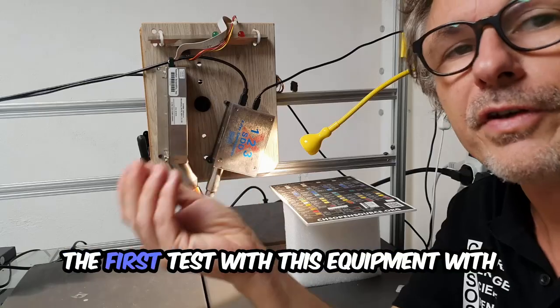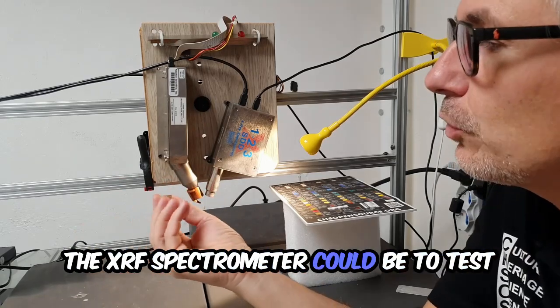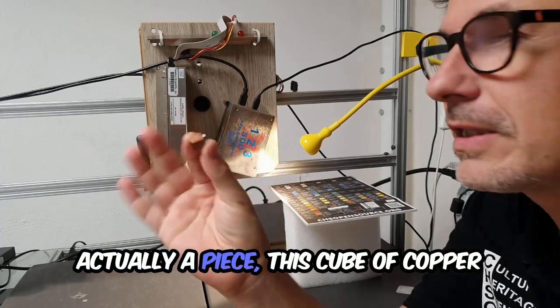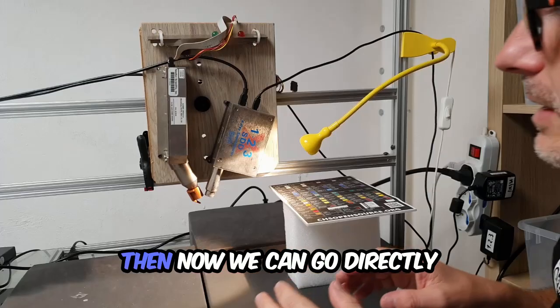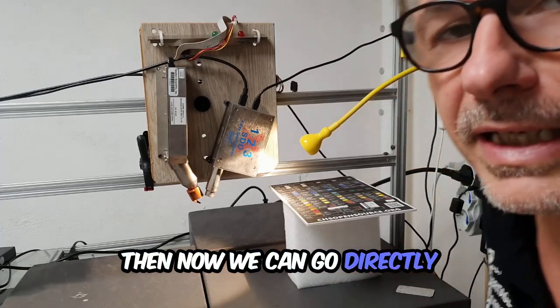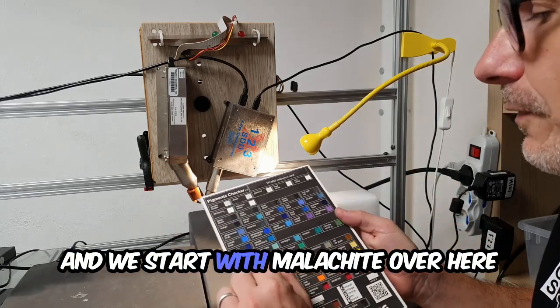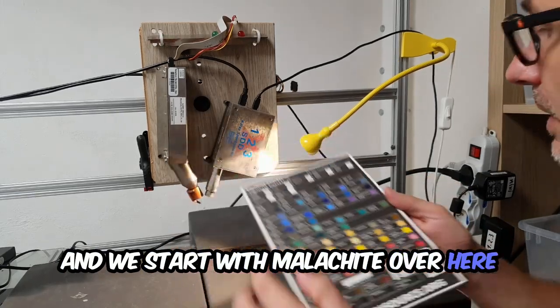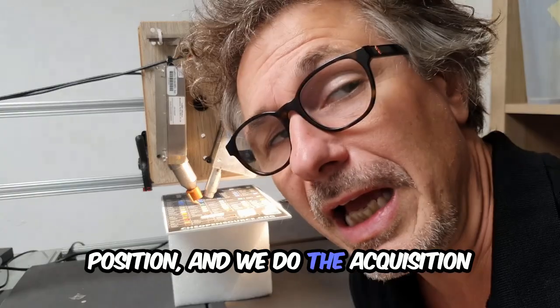The first test with the XRF spectrometer could be to test this cube of copper. Now we can go directly to measure the pigment checker, and we start with malachite. Malachite is in position and we do the acquisition.